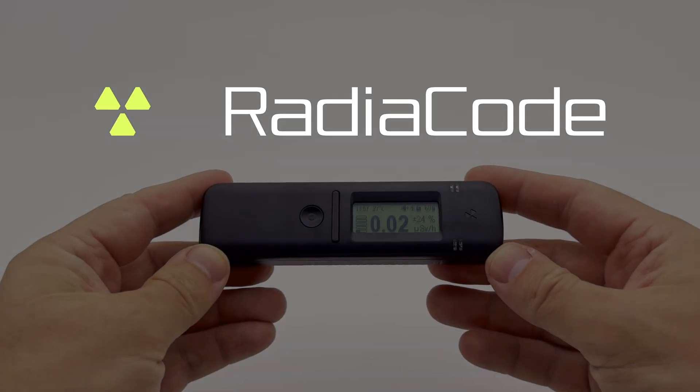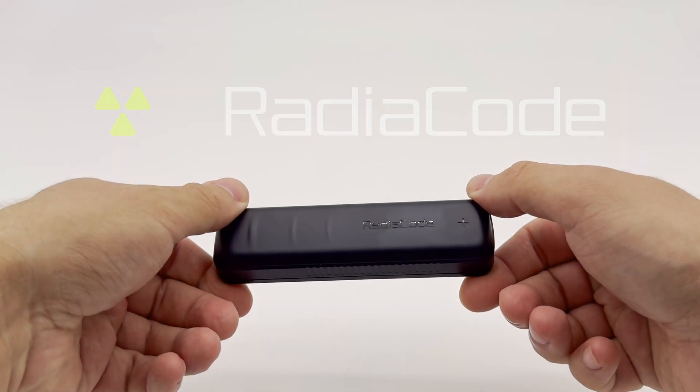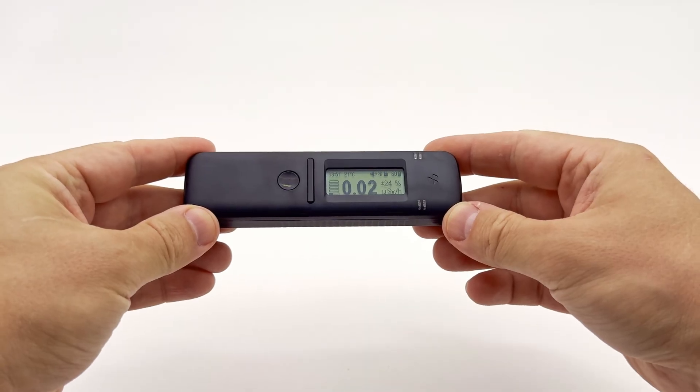Welcome. This is a brief guide to testing food products for radioactivity using Radiocode series radiation detectors.